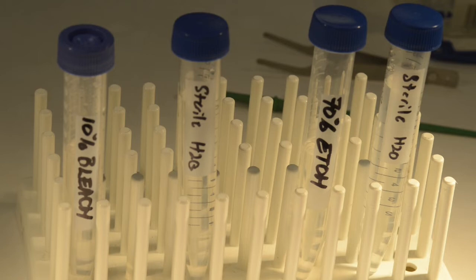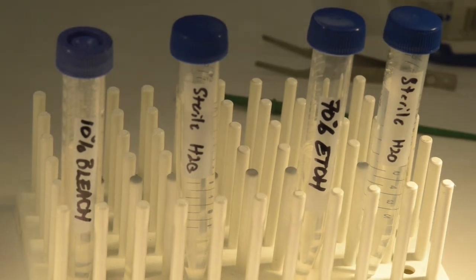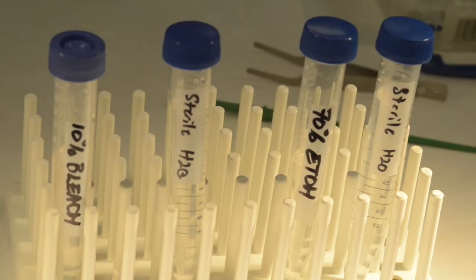In this short video, I will be demonstrating how to conduct surface sterilization of bean beetles using bleach, ethanol, and sterile water. This procedure is done in the following way.